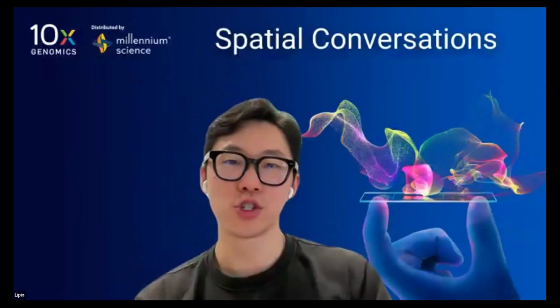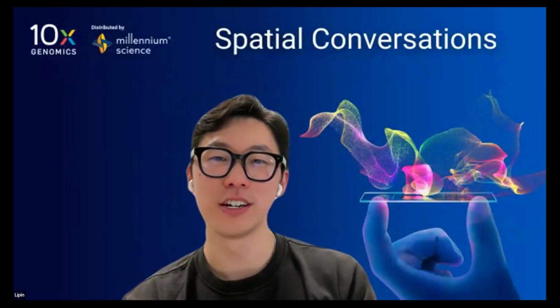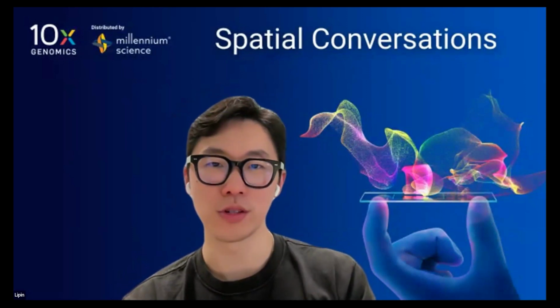Klaus is asking another question. If I can, I don't know how many people I'm blocking with me asking questions. Lipin, can you comment? In the first instance, did you use a multimodal stain for your Xenium work? No, I was quite early, so all we had was the nuclei stain. The segmentation that we did was primarily using the expansion from the nuclei.